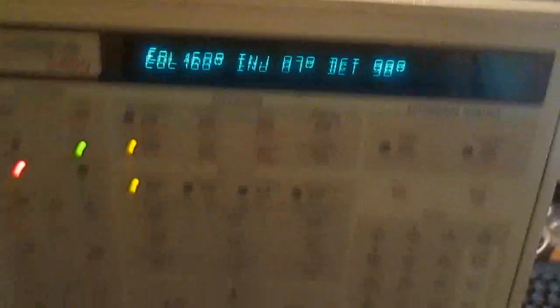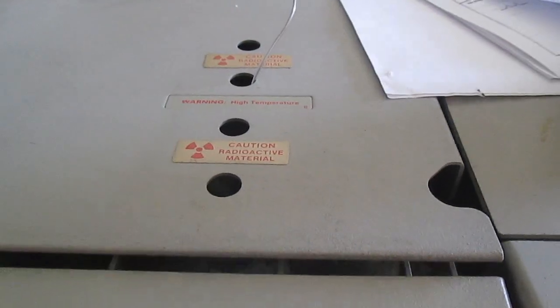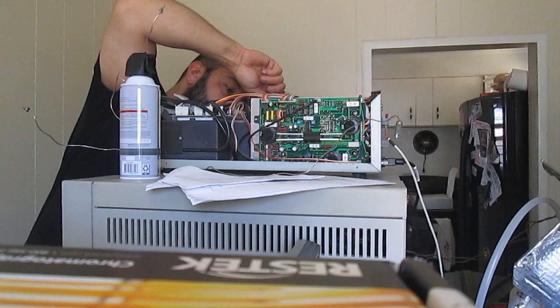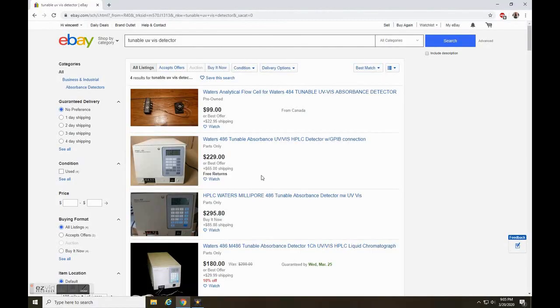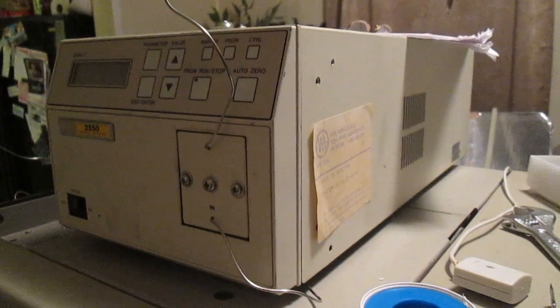The Varian unit seems to have some very serious issues beyond my ability to repair, but the HP seems to be operational. Although it was missing its detector, which contained a radioactive source that was removed before donation, I had to come up with an alternative for detection. eBay is my go-to source for scientific equipment and I found this $40 UV detector that just needed cleaning.